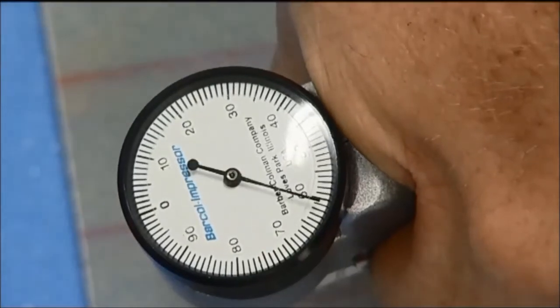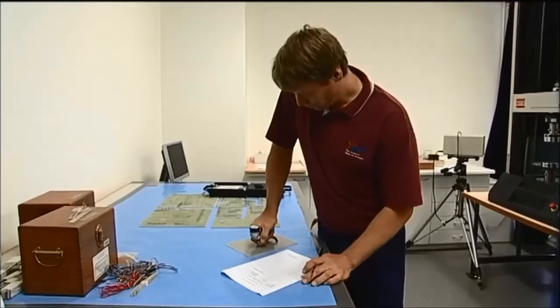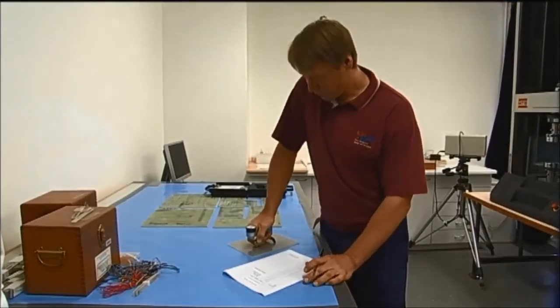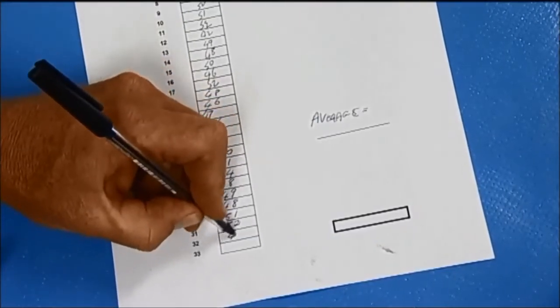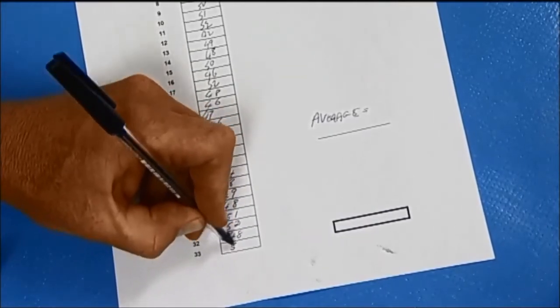The hardness of the material determines how far the tip indents, and this is transferred by a tension spring and lever to be read on a dial, which is converted into absolute Barcol numbers given by the instrument.